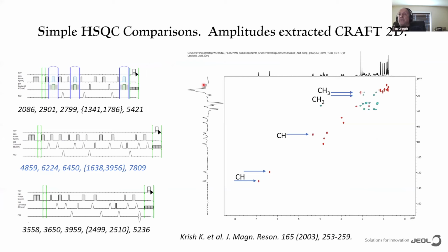So armed with the assurance that qNMR actually does work, what we can do is look at some pulse sequences. So here is basic HSQC. It's a tango pulse in HSQC, phase detected, not echo anti-echo. And here is what was published as the crisis HSQC.